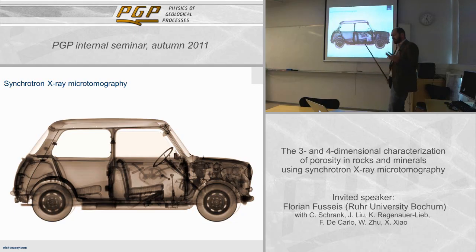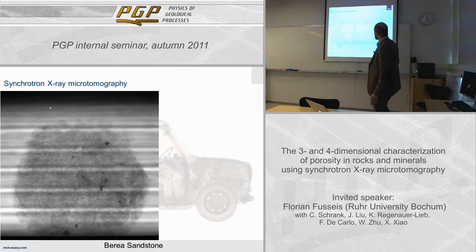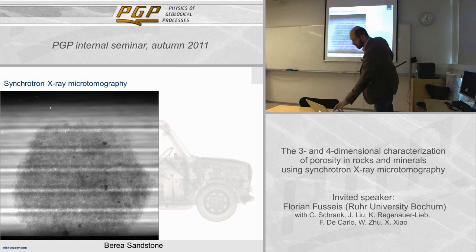We do the same thing, or synchrotron tomography, or X-ray tomography in general, is based on the same principle. We take a series of radiographs, and this is a piece of Berea sandstone, and what is just seen is radiographs that were taken from different angles. So essentially what we did was we rotated the Berea sandstone and took a radiograph after each rotation. Now, the way synchrotron X-ray tomography works, and how we get from this to a three-dimensional model of that piece of Berea sandstone, works roughly, and it's very crudely simplified, like this.